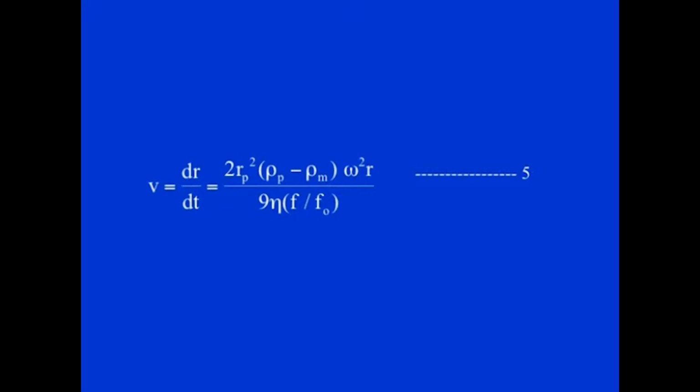So, this has to be taken into account, and this difference will depend on the particular kind of molecule, whether it is unhydrated, or sorry, hydrated, and spherical. All these factors have to be taken into account. Now, from the equations it is very clear that the sedimentation rate of a particle is dependent on many factors.